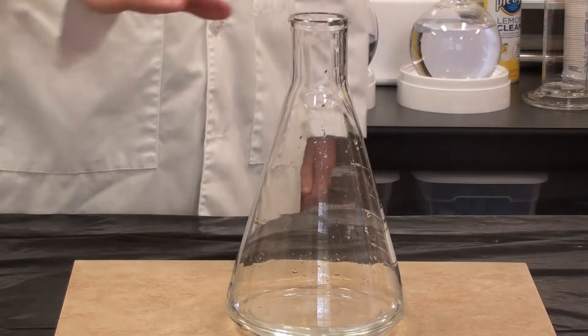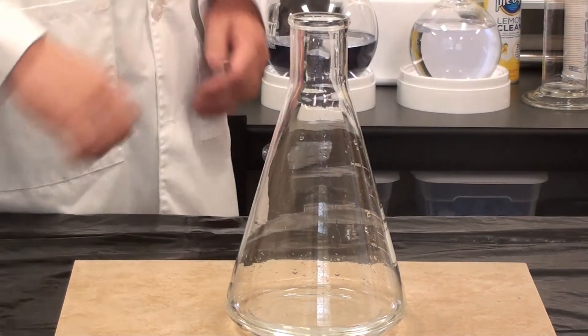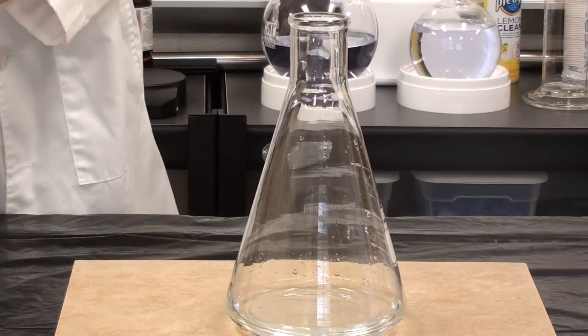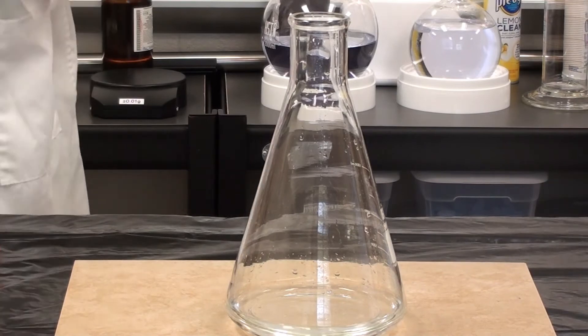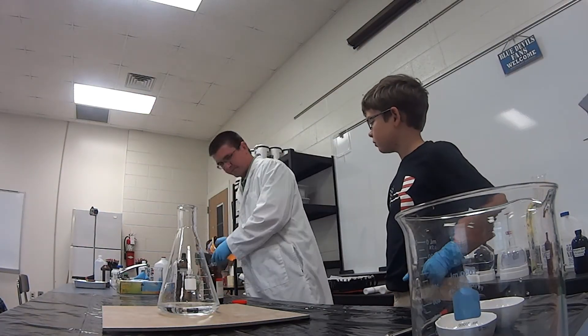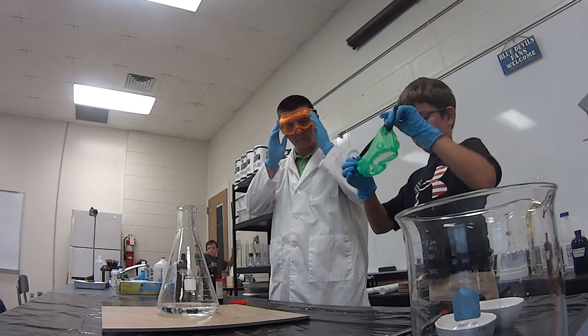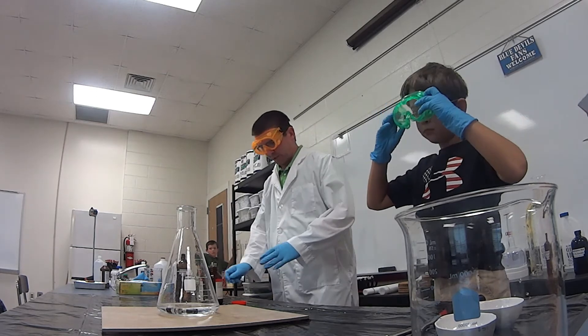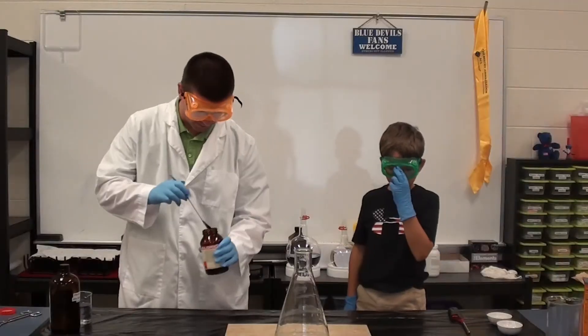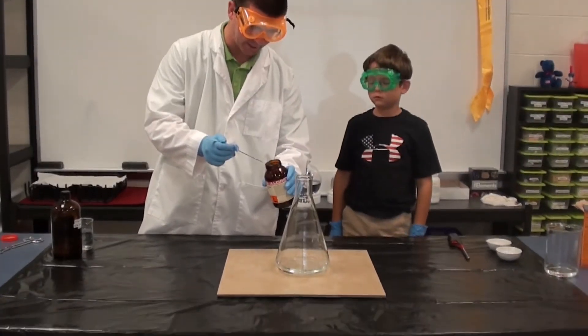But before we do it with the fire, I just want to let you see the reaction here. We're using a couple of chemicals. We're using just regular hydrogen peroxide like you'd get from the drugstore, and then we're using a chemical called potassium permanganate. So I'm going to have you put on some safety goggles here. I'm just going to add a little scoop of this potassium permanganate into our peroxide and just let you see the reaction that's taking place.